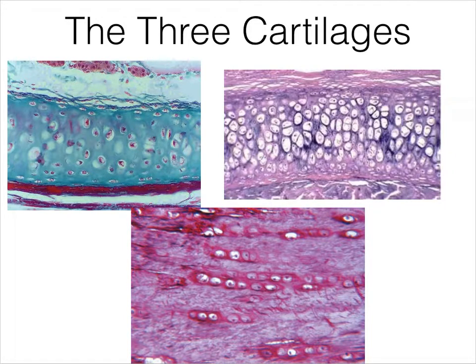You'll see a kind of random dispersion pattern of chondrocytes in lacunae that are medium to medium-high density. In elastic cartilage, you will have highly dense cells with the ECM in between them having sort of thin black elastic fibers in it. The cells will usually be larger.